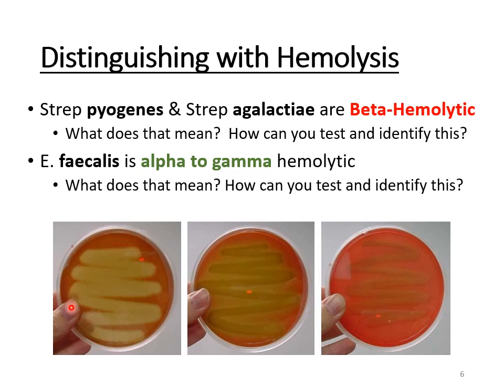So this first plate here shows beta hemolytic growth, where it looks almost bright yellow because these bacteria completely break down the red blood cells. They completely remove the red color wherever the bacteria is, which makes that plate end up being transparent now. Instead of being solid red, it's now transparent, so the light shines through it. That gives that see-through, almost glowing look to it.